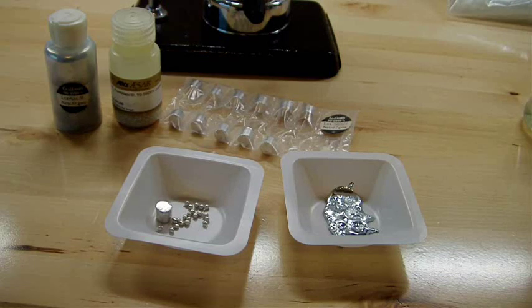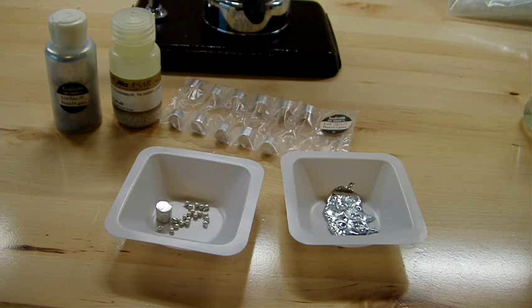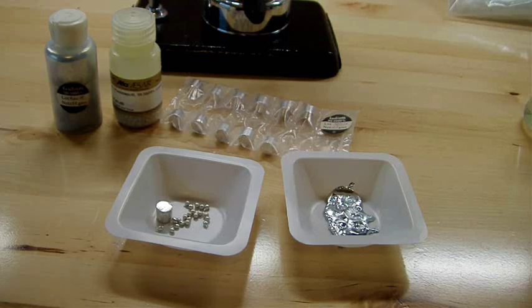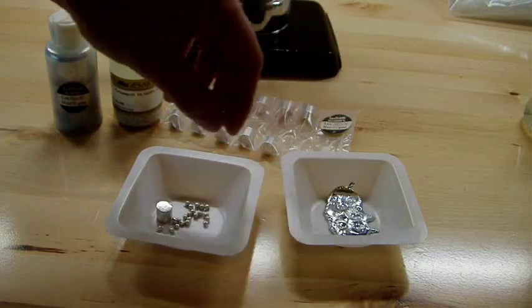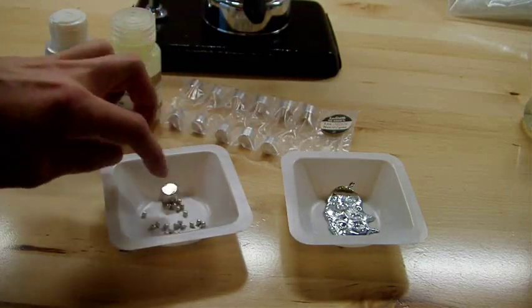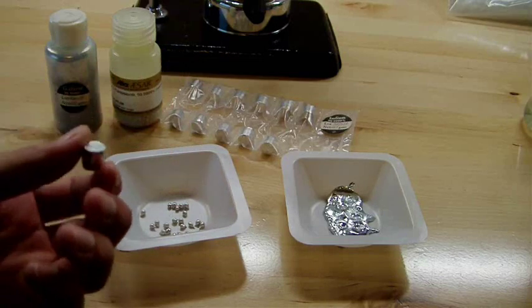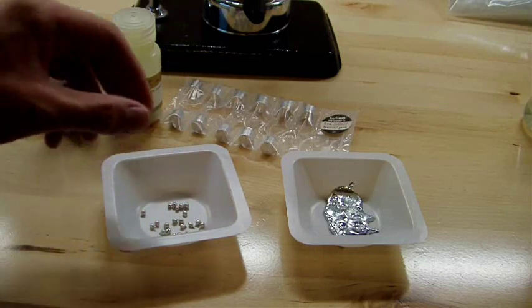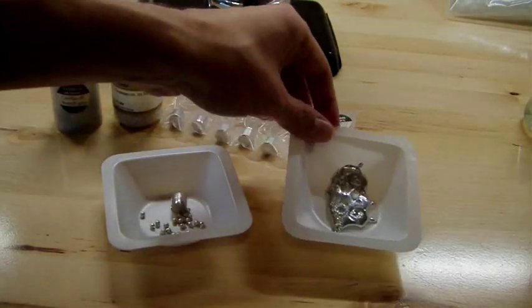So the composition of Galinstan is 68.5% gallium, 21.5% indium, and 10% tin, which I have laid out here. The tin is these little pellets, indium is the larger slug, and the gallium is what I have over here.